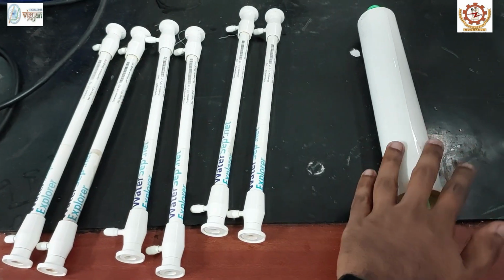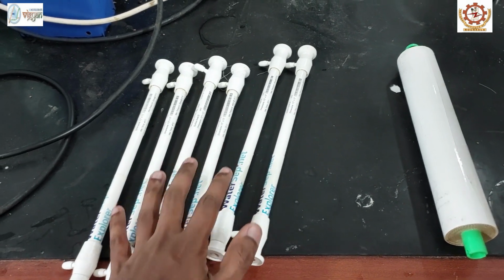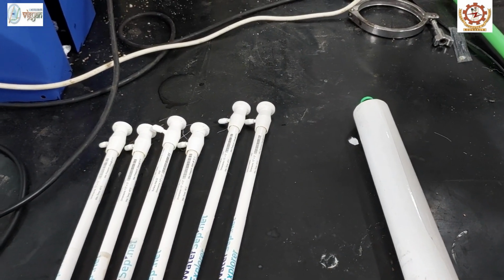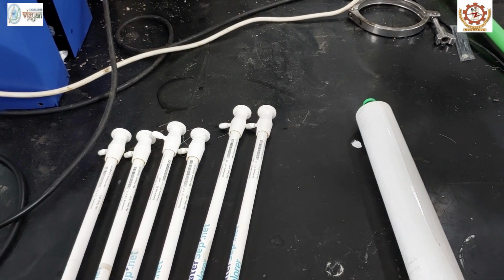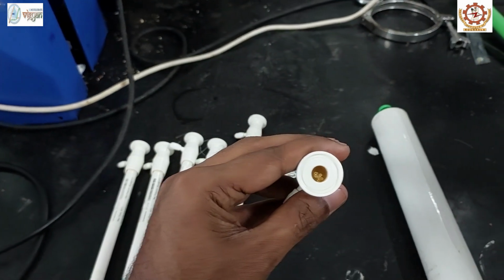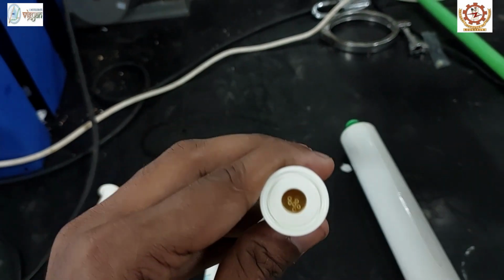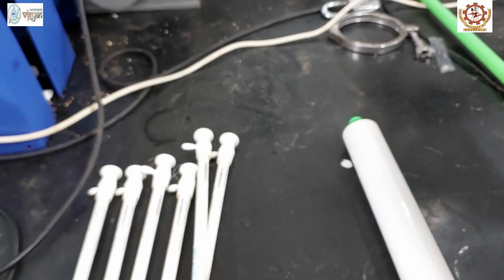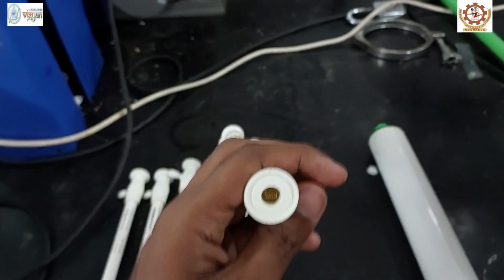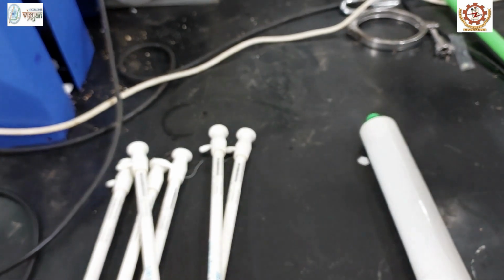These two are made up of two different membrane modules. These particular membranes are made using hollow fiber module. The hollow fiber module involves compactly packed bundles of thin tubular fibers. Each bundle is generally made using numerous single hollow fibers, usually in the range of 50 to 3000, thickly sealed on both the ends inside a shell tube. This arrangement makes the hollow fiber modules resistant to higher pressure.